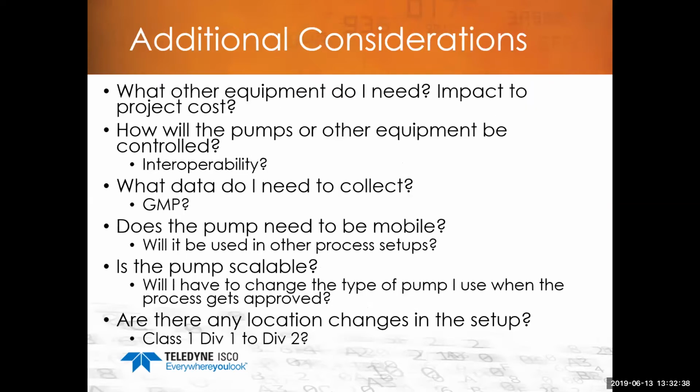As we come into the home stretch here, there are some other things you want to look at when you're thinking about flow chemistry and the pumping technology. What other equipment do you need? What is the project cost? Am I going to spend 80% of my budget on pumps to get pulseless, or am I going to spend 50% of my budget to get a couple pumps to do what I need to do? So you've got to weigh those out.